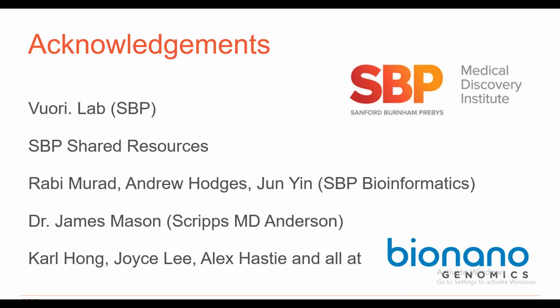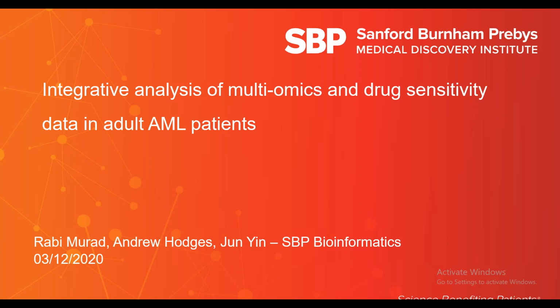So I will talk a little bit about the approach that we want to take with integrating the different multi-omics data sets that we have for the adult AML patients cohort that Ben talked about.